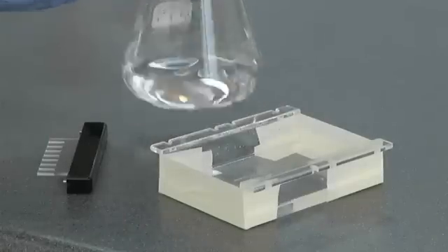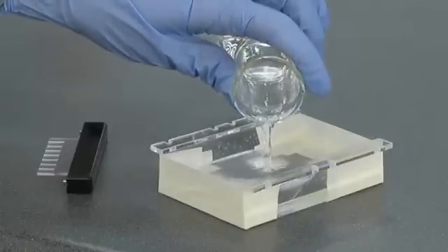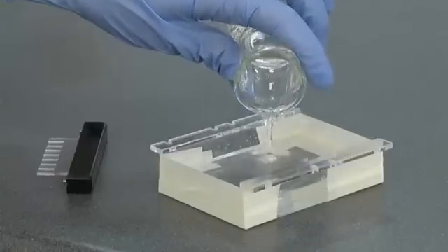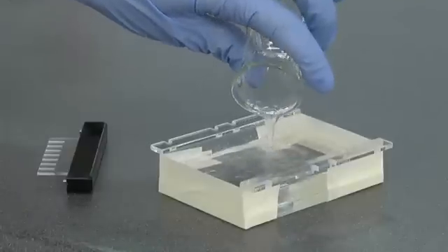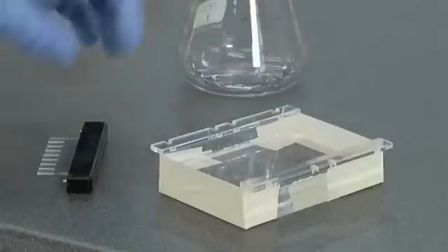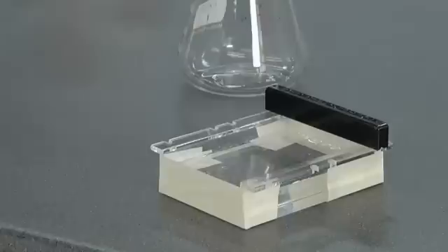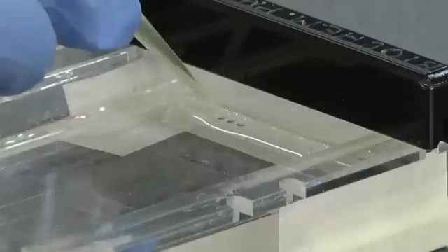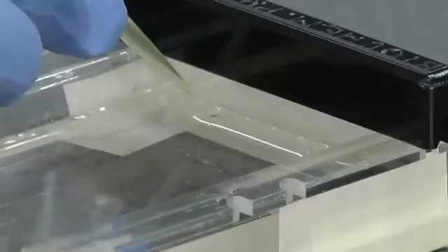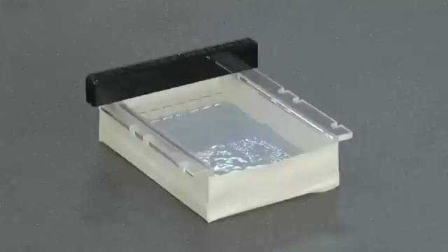Pour the agarose into the casting tray and insert the comb. Inspect the gel for air bubbles, particularly around the comb. Any air bubbles found can be either popped with a clean dry pipette tip or moved to the ends of the gel. Allow 30 to 40 minutes for the gel to set. It should appear slightly opaque once it's set.